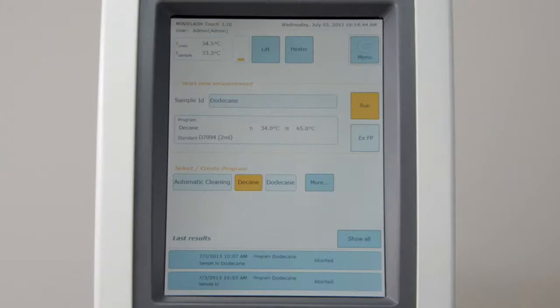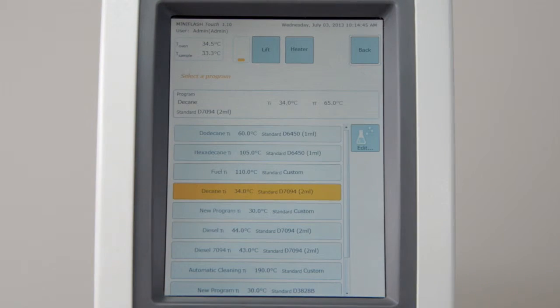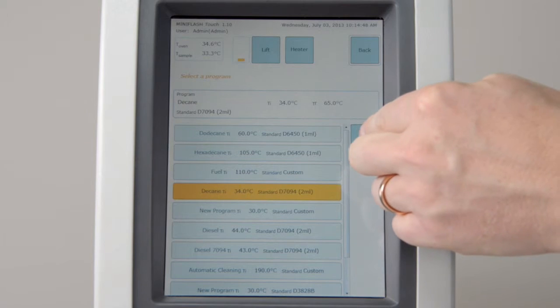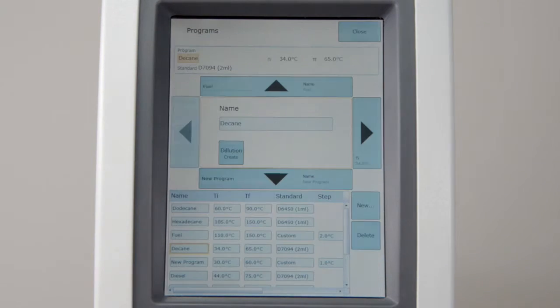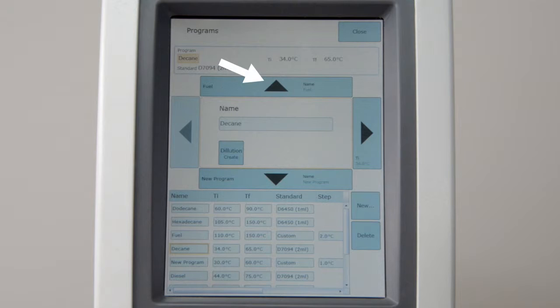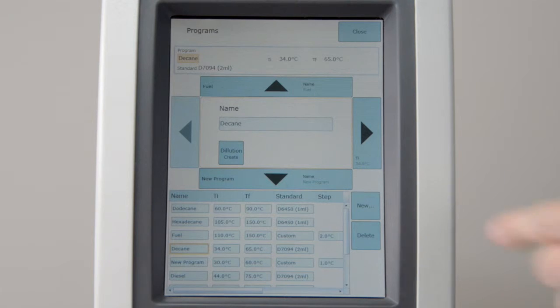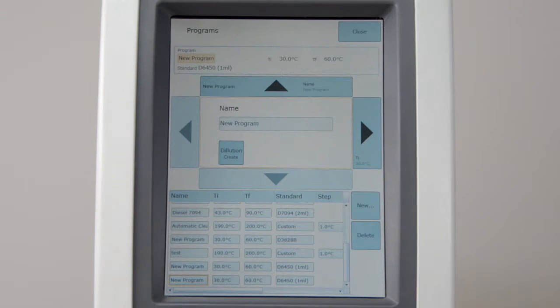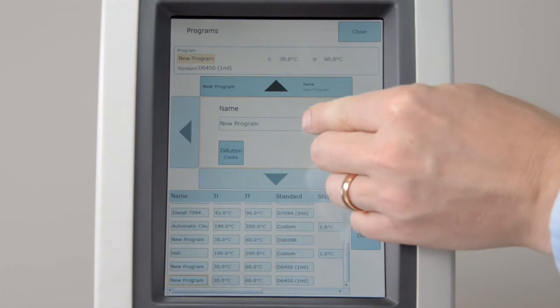To enter the program list, select More in the measuring screen. Press the Edit button on the right. The screen is divided in two parts. The lower part gives you a summary. The upper part allows you to navigate and change program settings. Please use the arrow keys to navigate between different programs and parameters. Press New to create a new program. Enter a program ID.